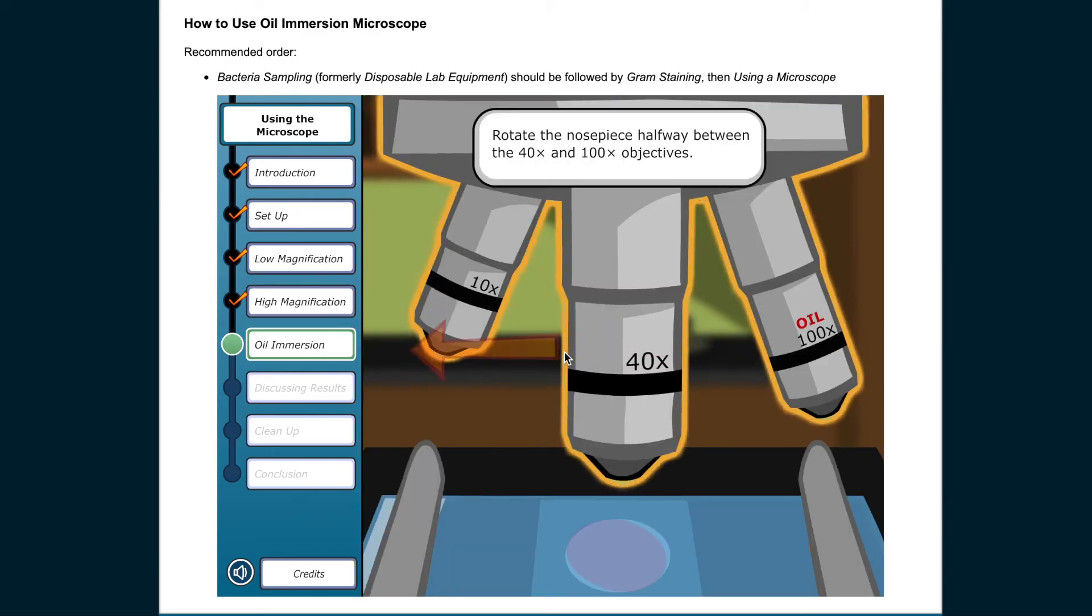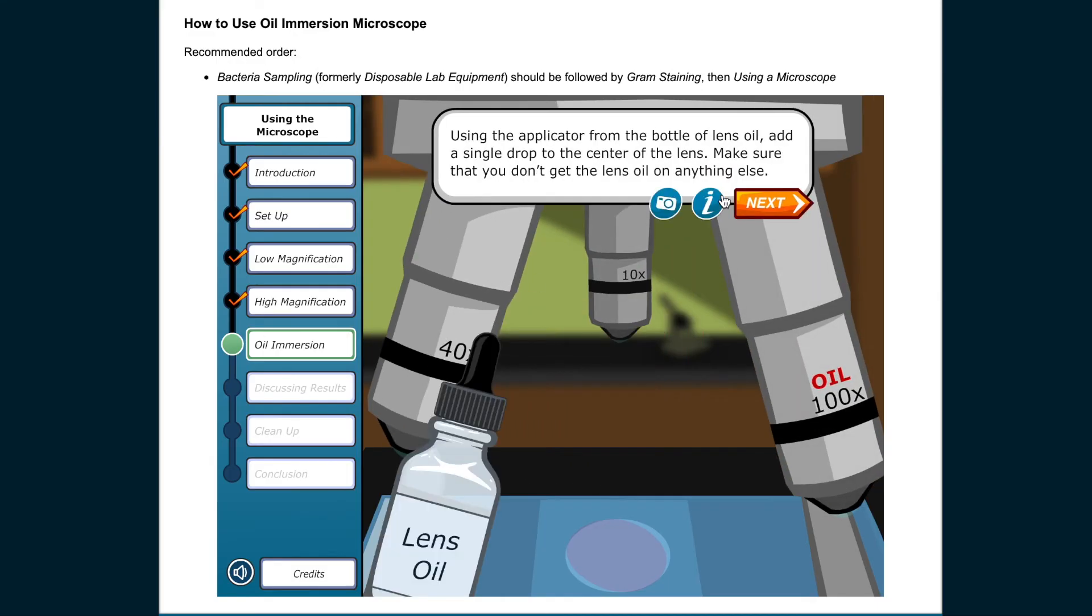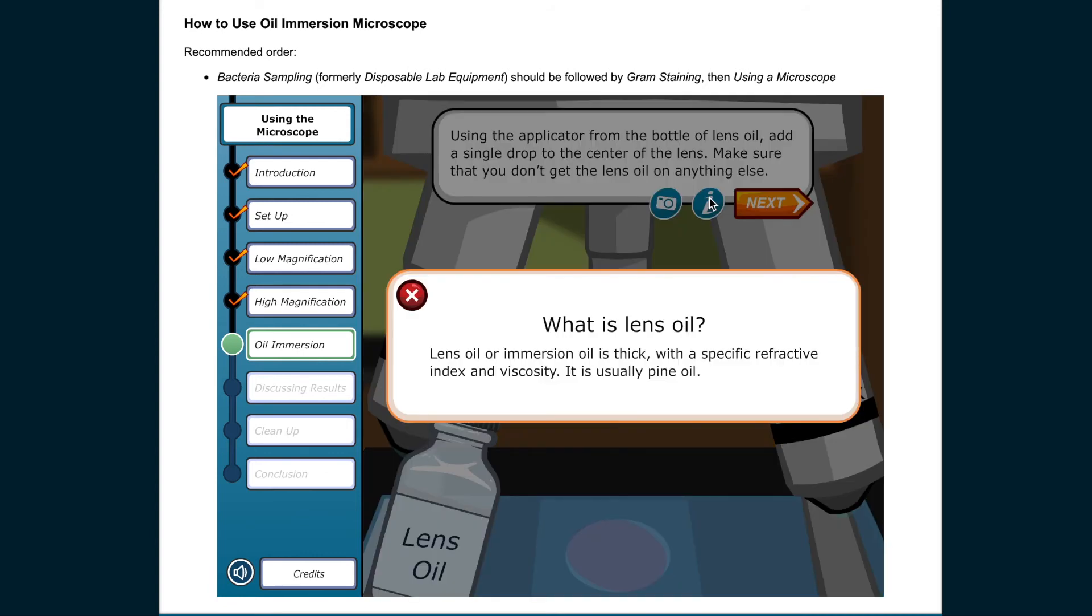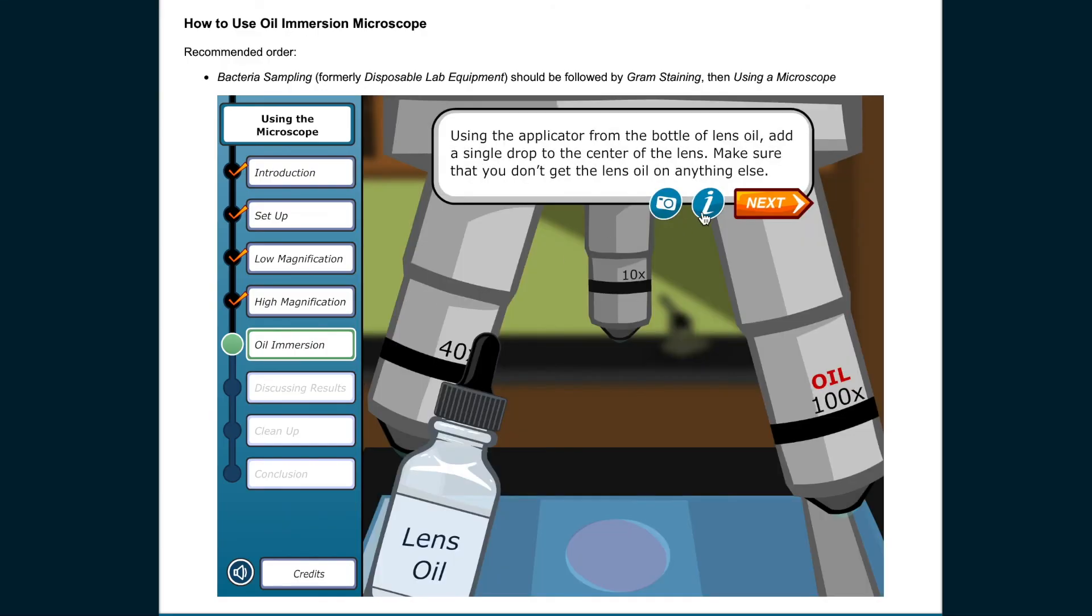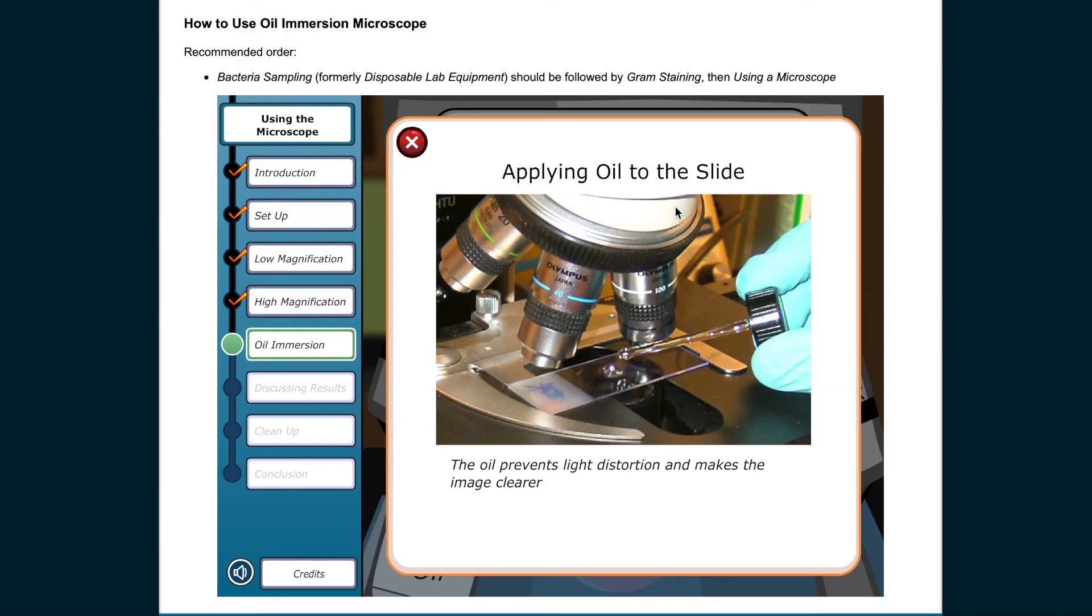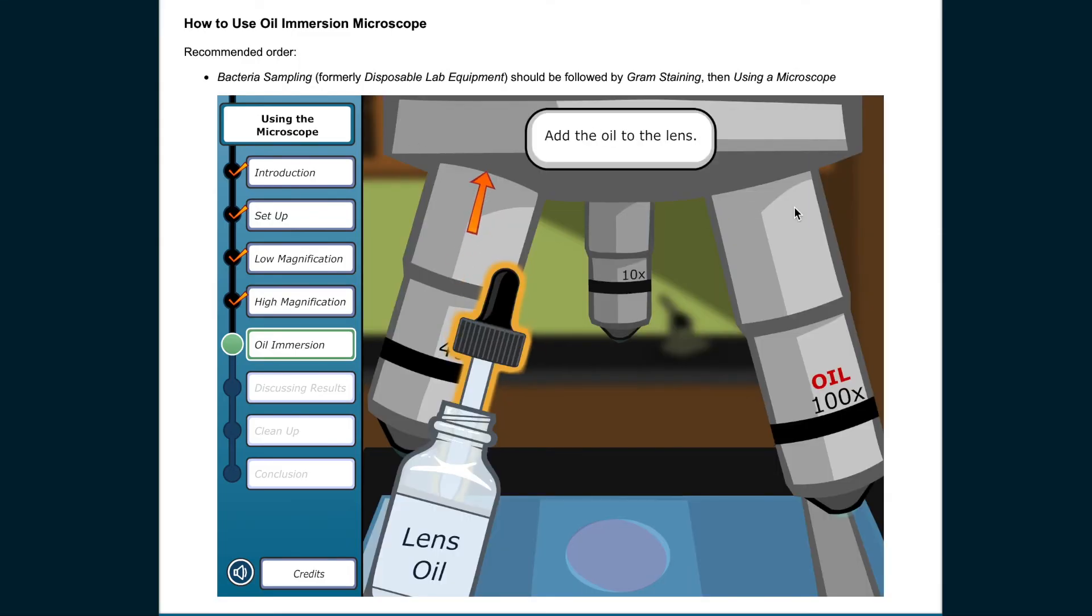Rotate the nose piece halfway between the 40 times and 100 times objectives. Using the applicator from the bottle of lens oil, add a single drop to the center of the lens. Make sure that you don't get the lens oil on anything else. What is lens oil? Lens oil, or immersion oil, is thick, with a specific refractive index and viscosity. It is usually pine oil.